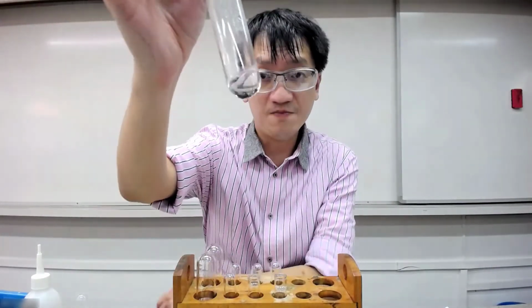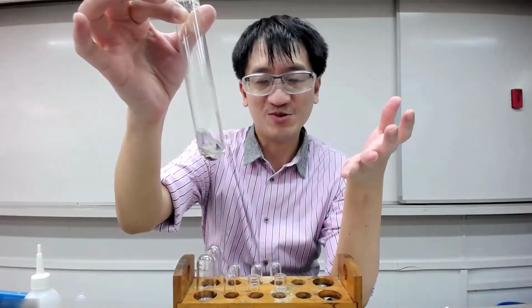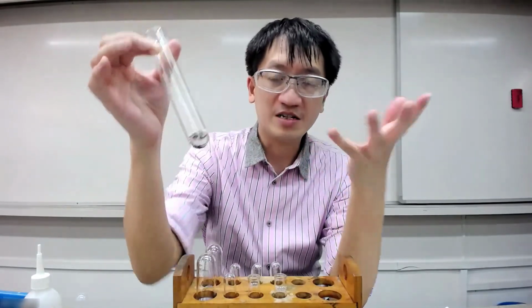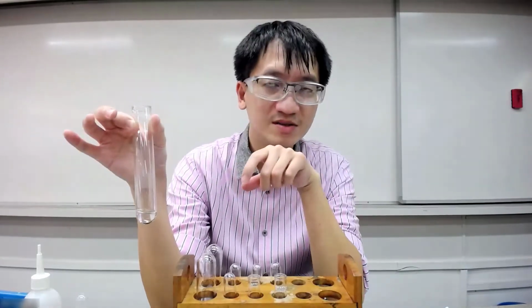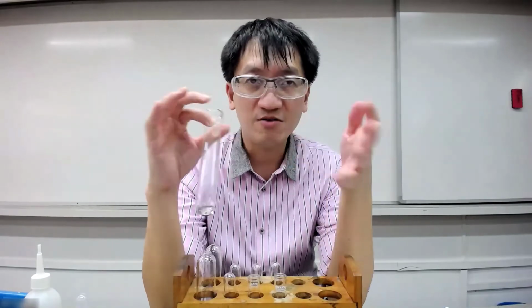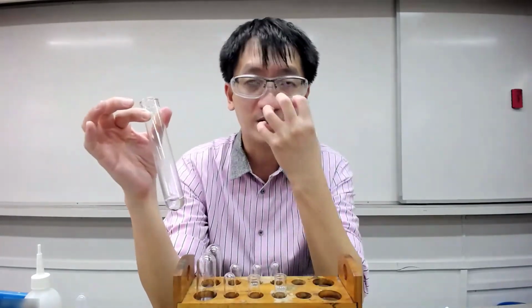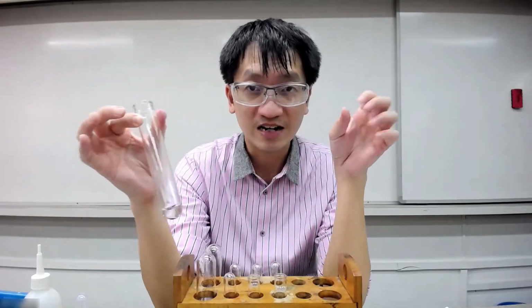Okay, but of course, you can argue that iron 2 is supposed to be pale green. Yes, but it is indeed iron 2 because if you just smell it, it has that blood-like smell. So iron 2 is inside. But of course, please don't smell in exams because you're not supposed to do that. But sometimes our senses, especially smell, do play a very important role in identifying stuff.